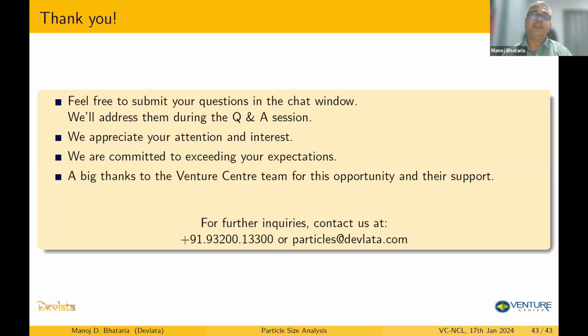So microscope techniques are there, but good for something like, I would say, slightly below 1 micron. Above, no problem. But as you go lower on size, 0.1 micron and below, you'll have difficulty using a microscope. But if you're considering TEM or SEM, yes, definitely they'll go much lower in size, but they're also much more expensive.